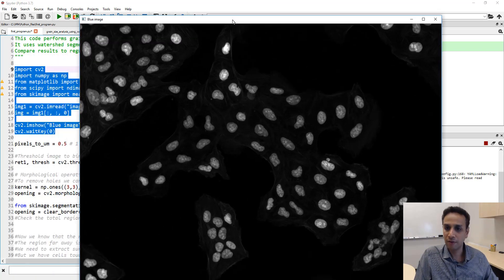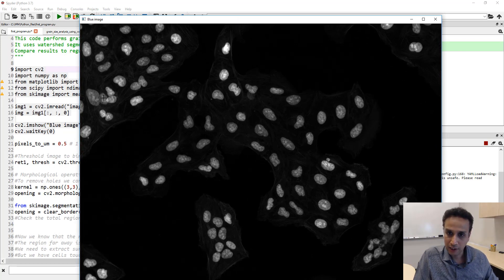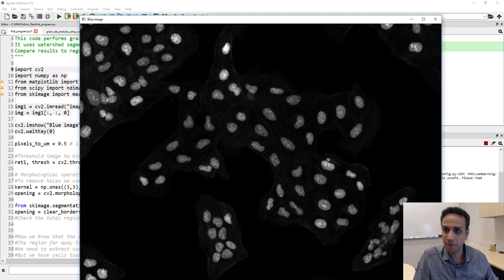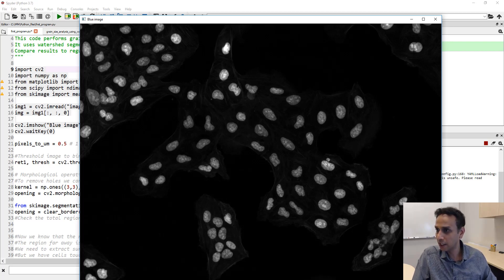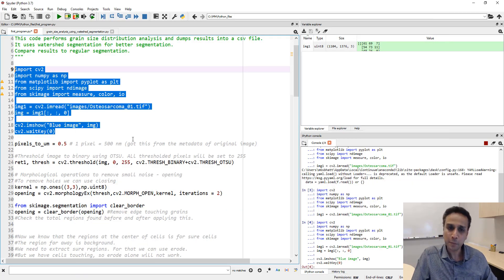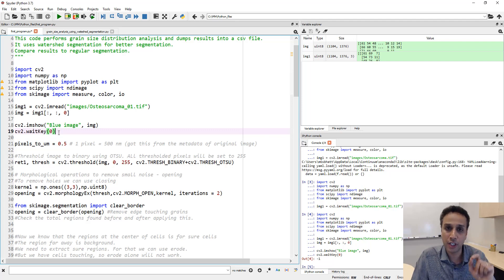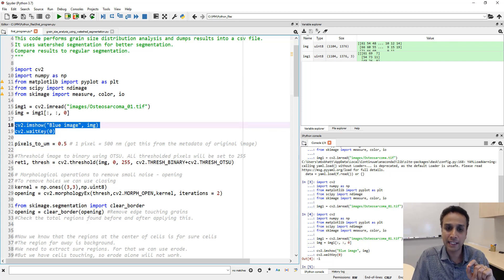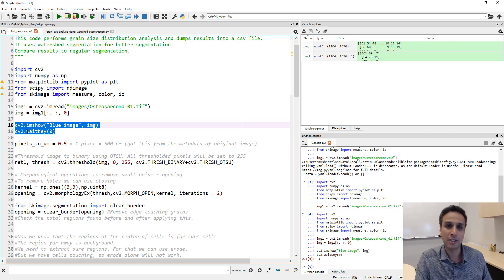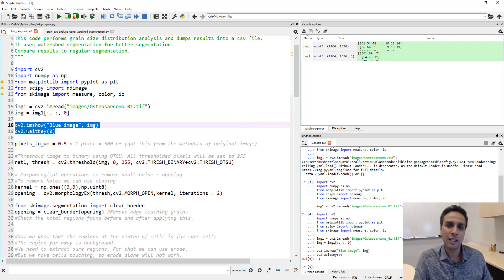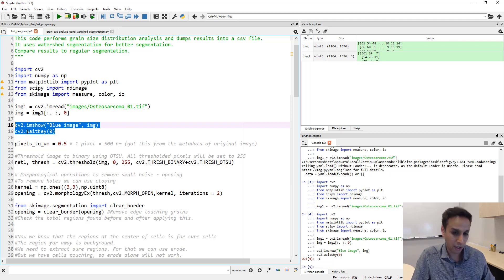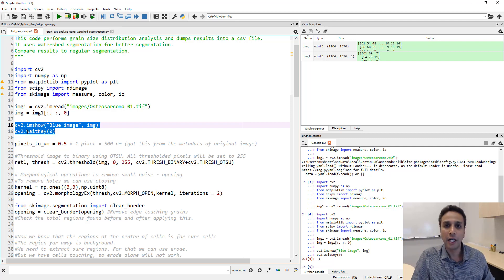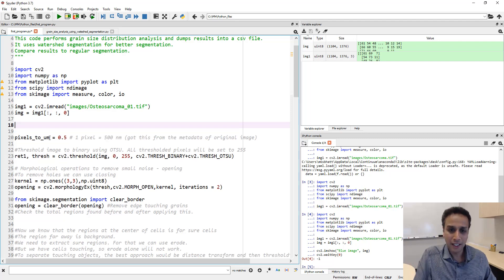Here is the image. Very nice. These cells may be a bit difficult to separate, but most of these are pretty nicely well separated beforehand. Some of these can be a bit challenging. These two, we'll see how we'll do, but that's exactly why we have watershed. If you just use thresholding on this sample you cannot separate those cells. In fact the best way to do these type of things is using machine learning where you teach the algorithm how all these cells look like. But that's beyond the scope and I do not have that type of knowledge yet.